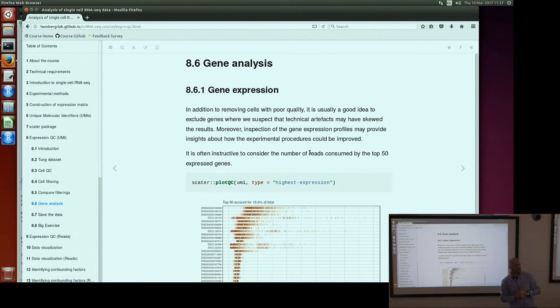Generally speaking, if you're subsetting an SCE set object, then you can use logical indices, you can use names of the cells, so cell names, sample names, or you can use integer indices, and all of those will work correctly to subset.